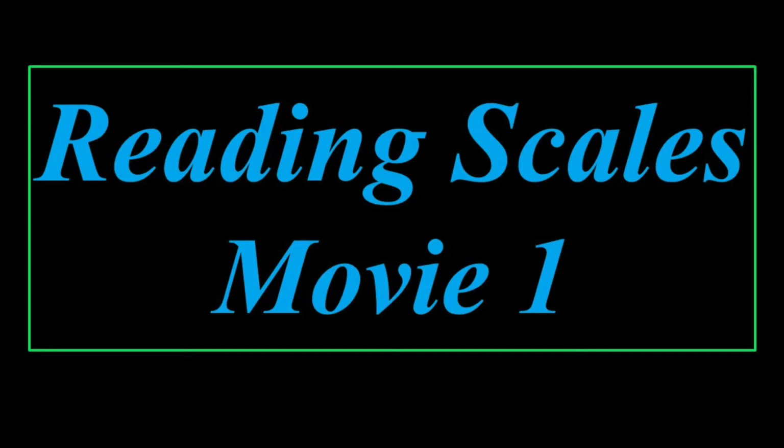All right, so this should be the first movie that you watch in terms of understanding scientific measurement and dealing with the reduction of laboratory data. So you need to be able to read scales. That's the very first thing. You have to be able to read scales, understand accuracy, understand precision, especially precision, and read the scale properly.